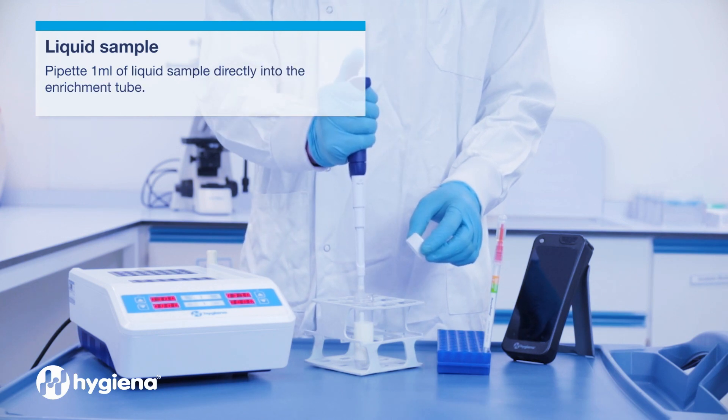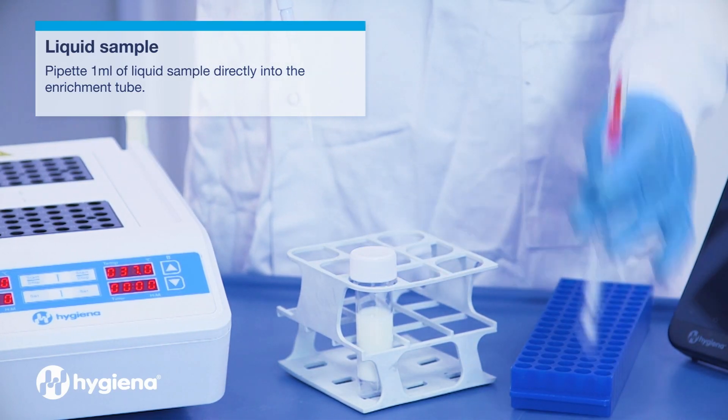For liquids, pipette 1 milliliter of liquid sample directly into the enrichment device.